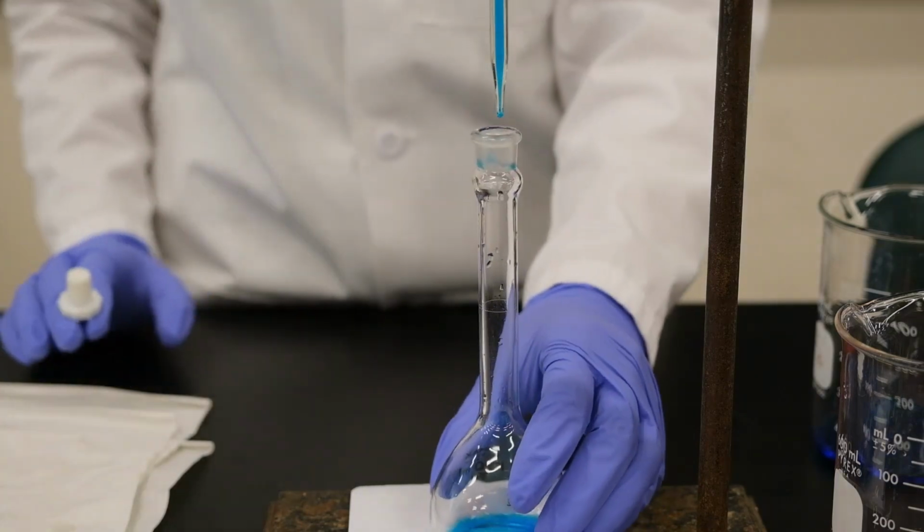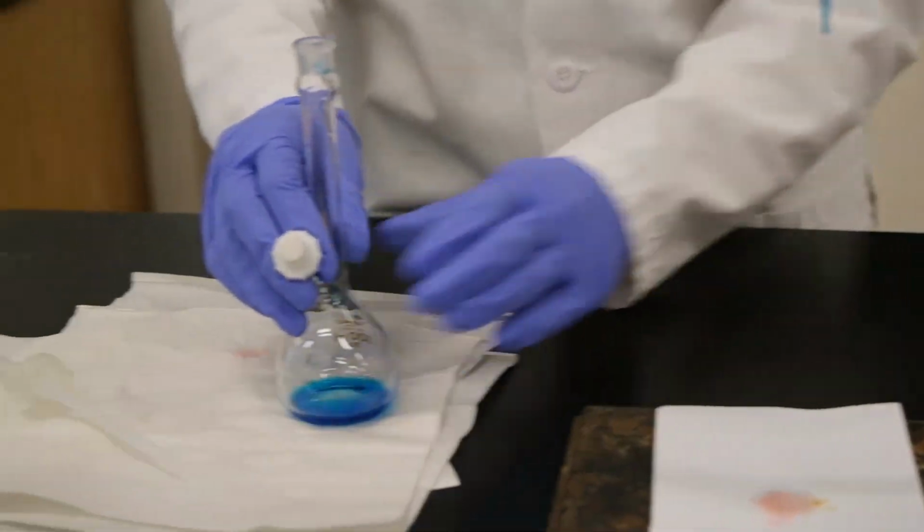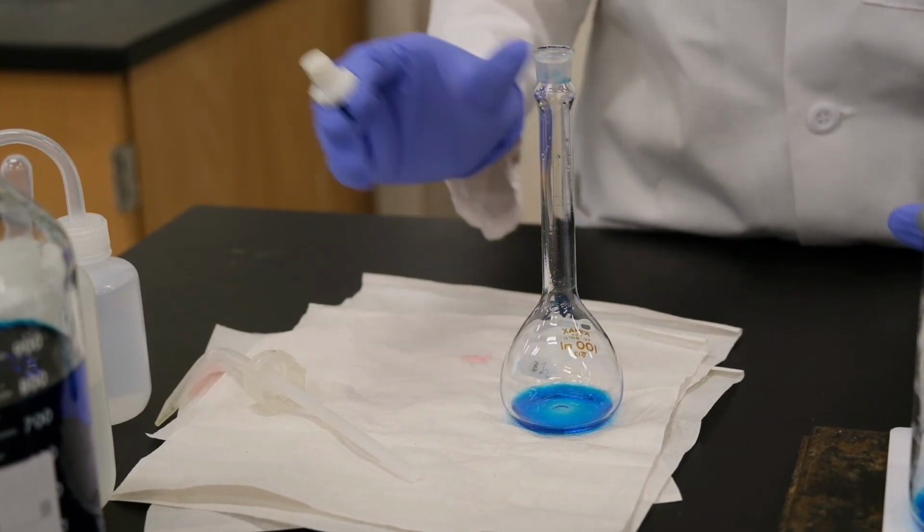Now that we've added 3 milliliters, we're going to be filling the rest with deionized water.